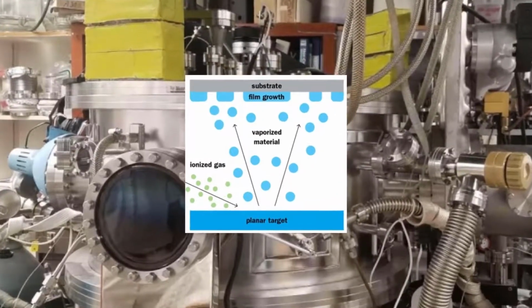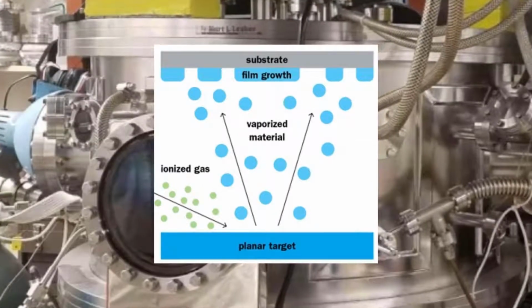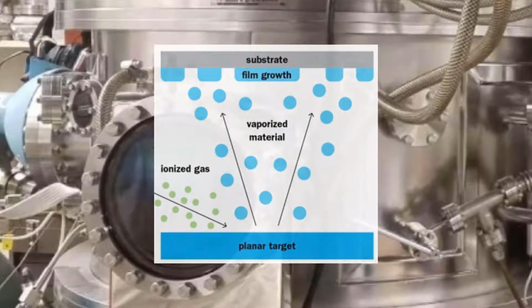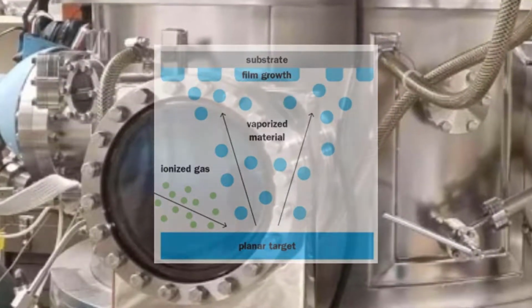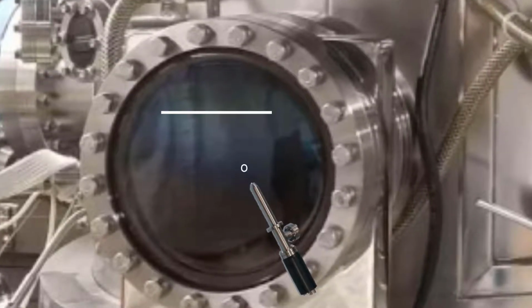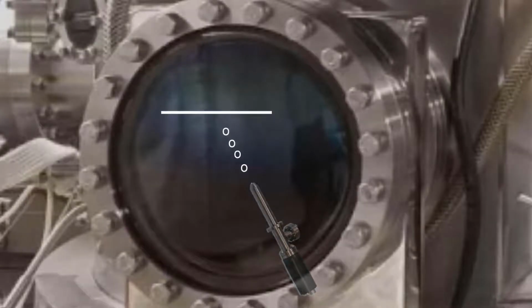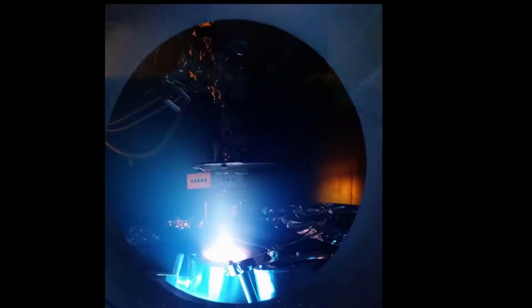Sputtering is a type of physical vapor deposition and is used to deposit metal onto a surface via ion impact induced vaporization of some variable deposition material. This process is usually performed in vacuum at room temperature. In sputtering, an ion gun ionizes an inert gas, which is then accelerated towards the deposition material or materials. The high-energy ion beam impacts the deposition material, causing it to vaporize and deposit onto the substrate.